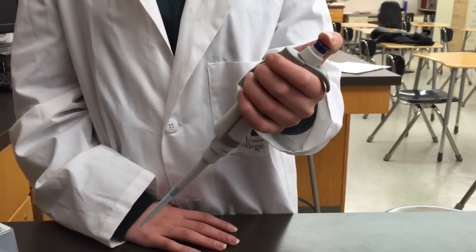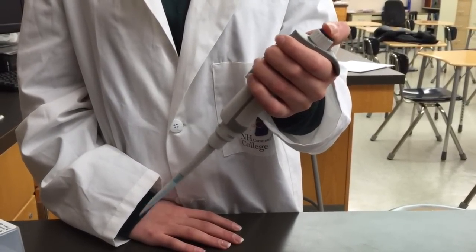When pressing down on the control button, you may notice that there are two separate depressions. This is really important.